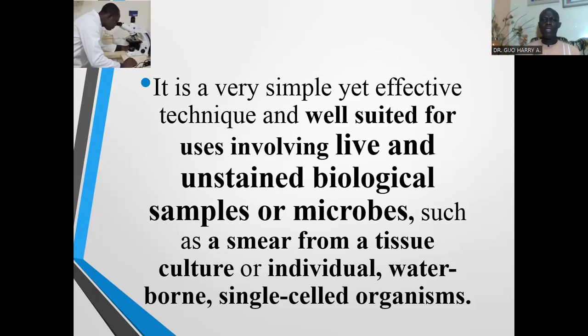Now, the dark field microscope is used to view live and unstained biological samples or microbes. Microbes that are not stained and that are still alive can be easily viewed with the dark field microscope, and it is very effective in viewing such microorganisms.